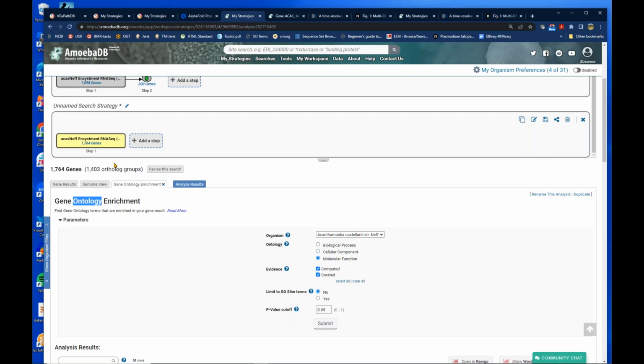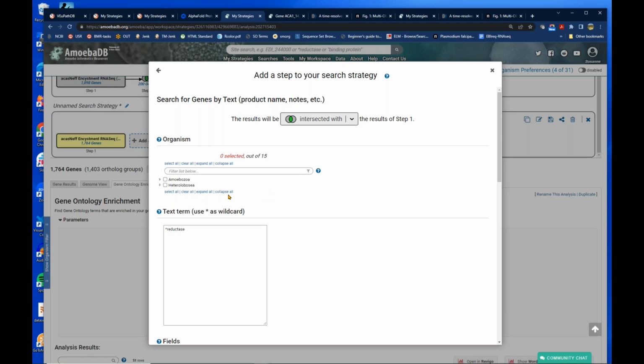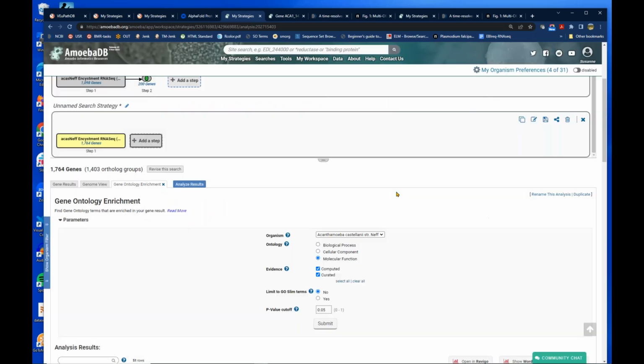You can run an additional search to identify any genes that fit within the criteria if you wanted to go and look at them a little bit further, and let's say look for any domain signatures or motifs, etc., and see if you can learn a little bit more.